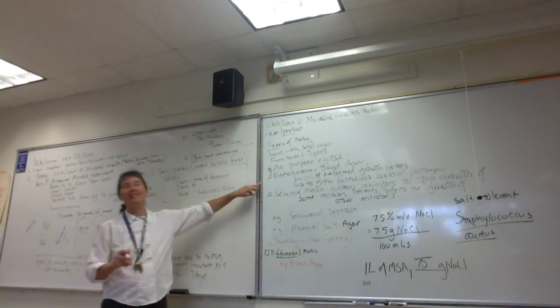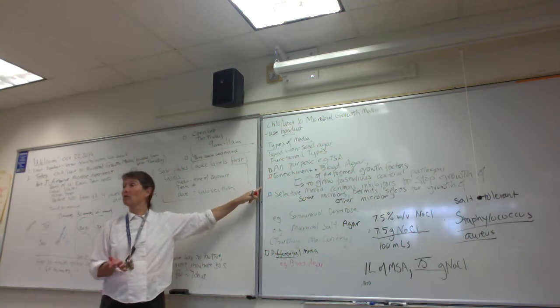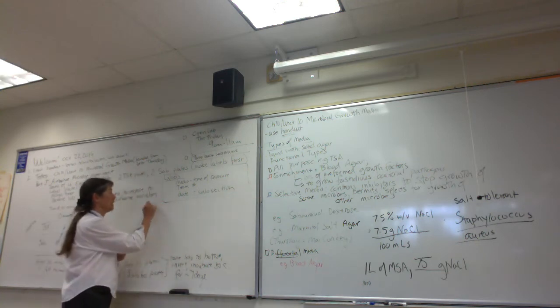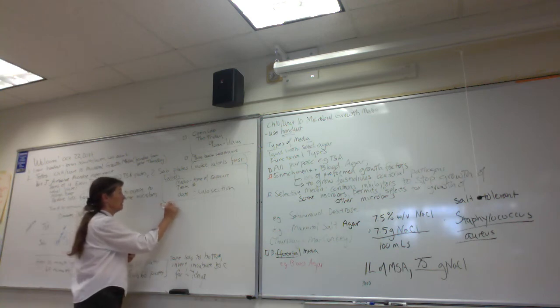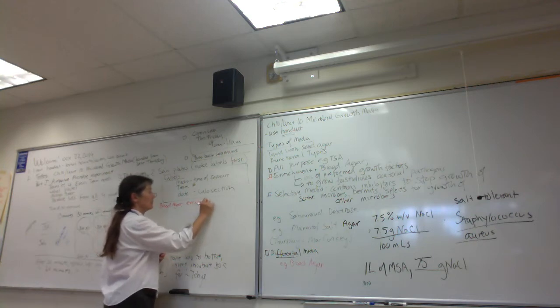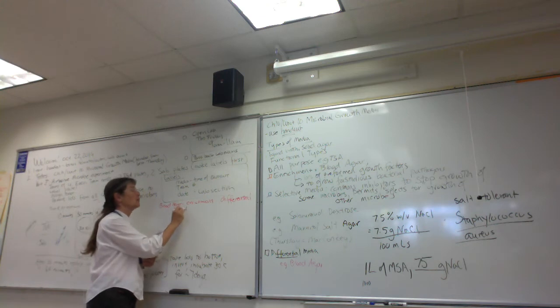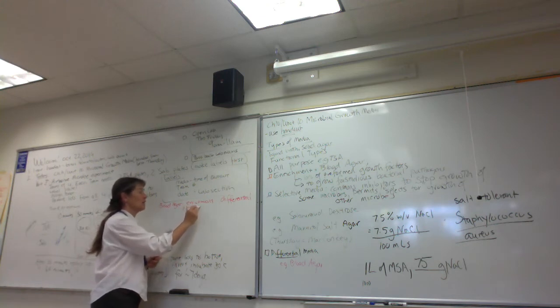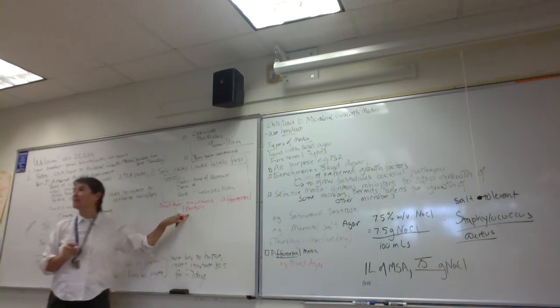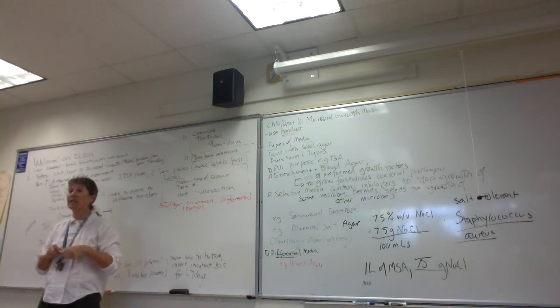So we're going to use as our example today, you guys, blood agar. Okay, so we know that blood agar is enrichment, right? And it's also differential. So we'll see Thursday that media can have more than one function. So you guys, let's take a look at blood agar then. Okay, so it's enrichment and what else? And differential. Good job, folks. And it's differential based on which property? Based on hemolysis. What do you think hemolysis is? What does hemo refer to? Blood, right? Blood lysing. Okay, so hemolysis is the ability to break open red blood cells, and it will change the appearance of the agar, folks.